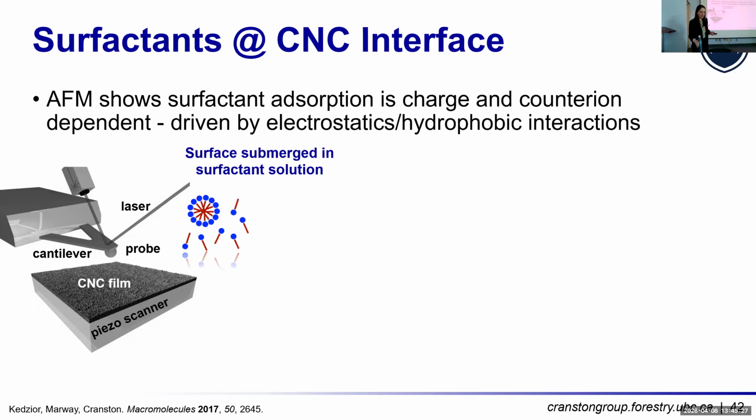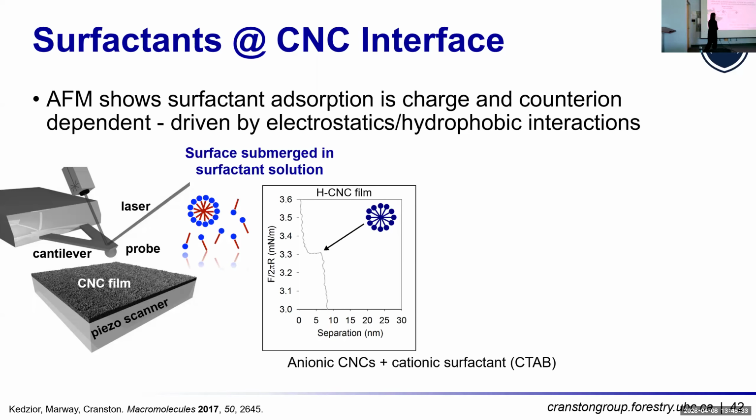And we want to know, what is the surfactant doing? How is it binding or adsorbing to the interface? And so in our force curves here, again, probe, surface, you're approaching, and we have this big bump. And this bump here is exactly the size of a micelle. So we know that we have a bunch of surfactant micelles that are adsorbing and sitting along the surface.